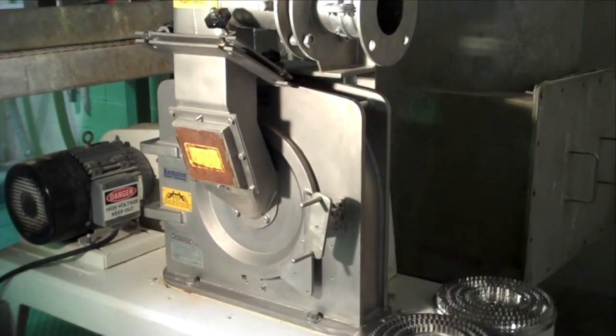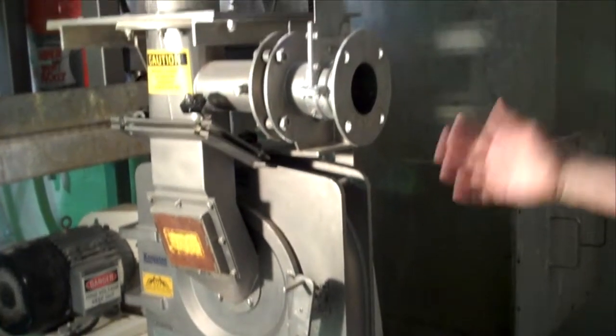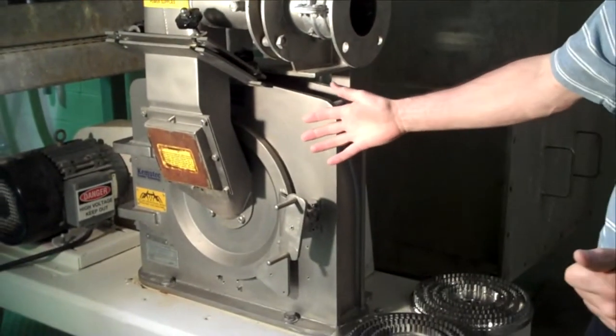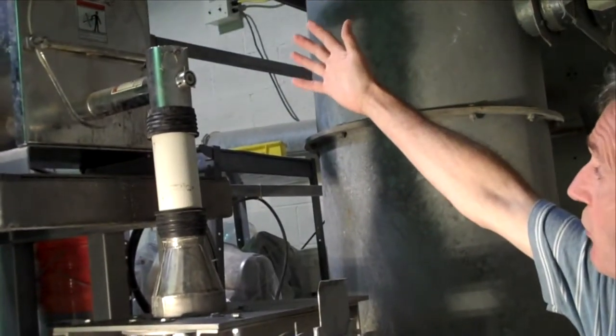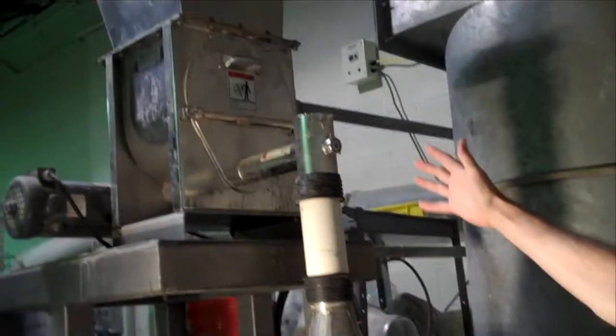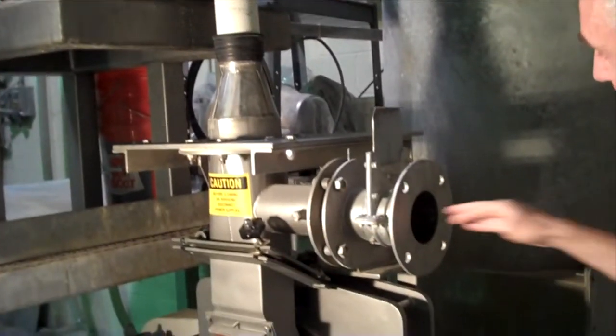Here we have a KEP universal mill system comprising the basic mill which is down here and being fed from above by a volumetric screw feeder which controls the infeed product down through the combined inlet and air intake system.